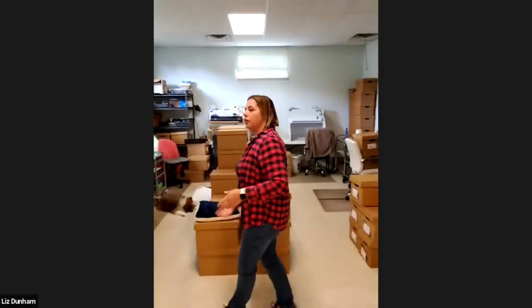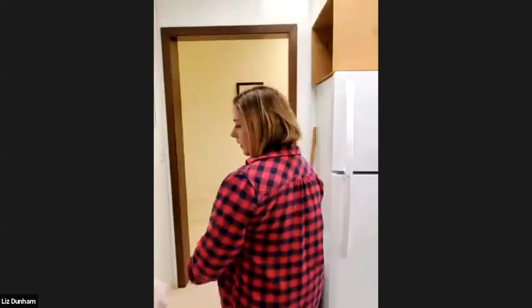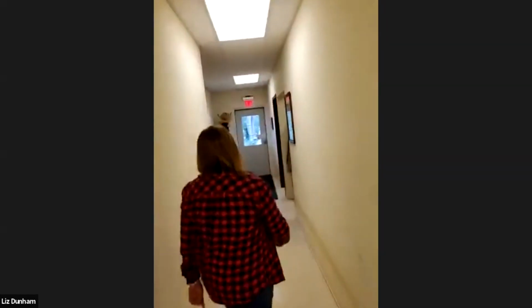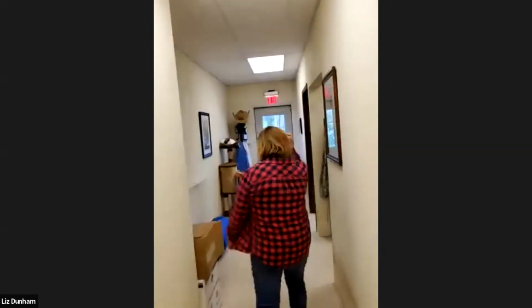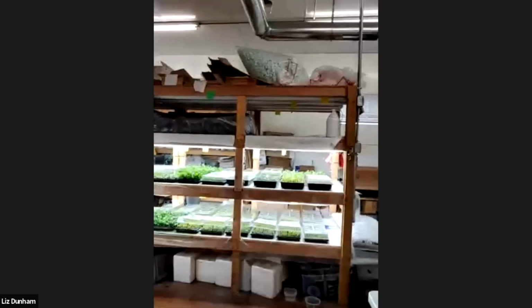So this is our hood room. This is where we do all the transferring. You've seen the media prep room. That's where we do all of the mixing of the media that we need. Of course, we have a dishwasher that runs a lot because we reuse all of our jars. We don't send any tubs out. If we send stuff out of culture, it's washed in a baggie.